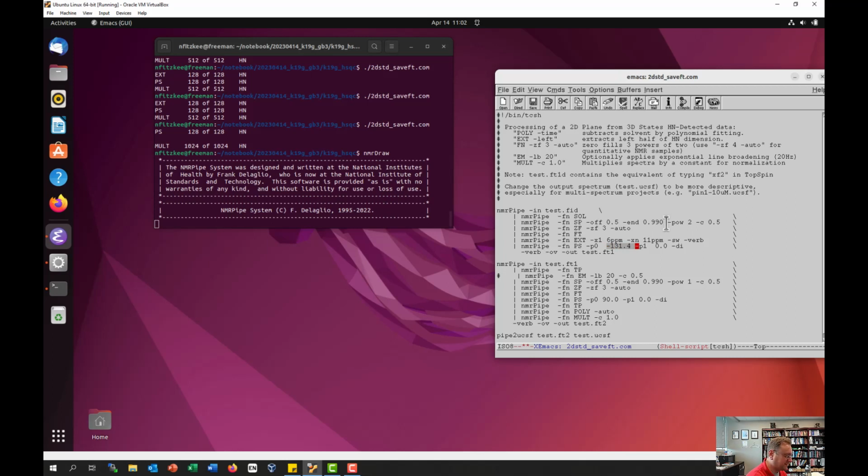So this is why I always like to have a calculator. If I do minus 131.4 plus 149.2, so positive and negative matters, I get a final value of 17.8. And so I'm just going to delete that, and now I'll write 17.8.